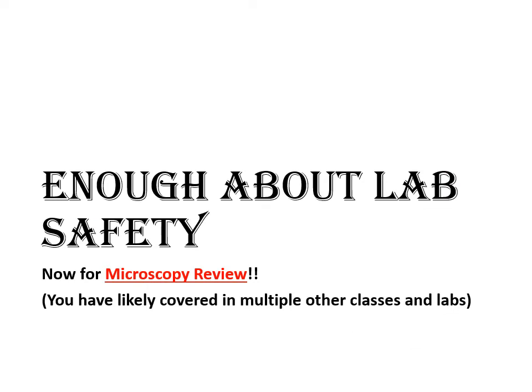Now that's enough about the lab safety. We'll revisit some of that information when it comes closer to the possibility of having some in-person laboratory classes. For now, what I want to do is move on to the microscopy review, and you've probably encountered most of this in your other classes, so I'll kind of run through it rather quickly. But again, if I go through anything too quickly or you need some practice problems or any extra information, please contact me in Remind. Never hesitate to contact me in the Remind app.